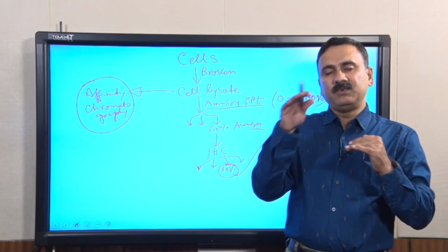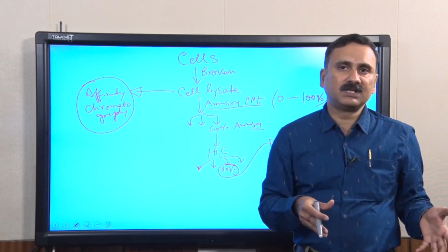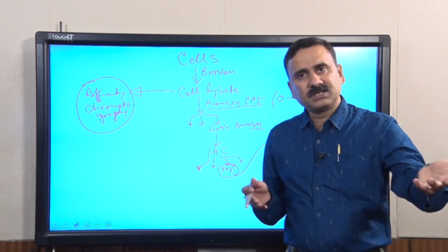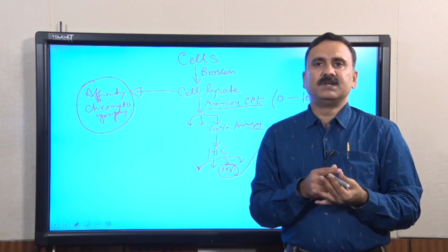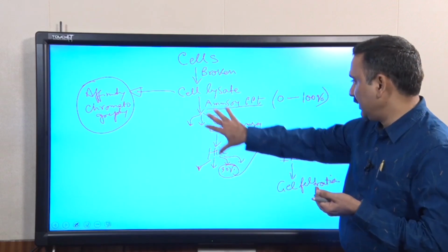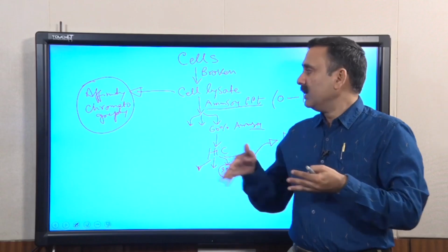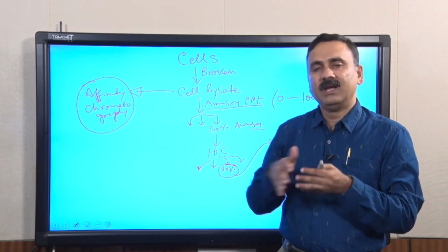So, I will keep using the combination of hydrophobic interaction chromatography, ion exchange chromatography, and gel filtration chromatography, and within the ion exchange chromatography I have the option of using anion exchange or cation exchange chromatography. Using all these combinations, you will probably be able to get the purified protein. If you follow this type of scheme, definitely there will be more losses of your protein, which means the recovery as well as the yield is going to be low. Compared to that, if you have the affinity tag, then you can directly use affinity chromatography, and that is it.